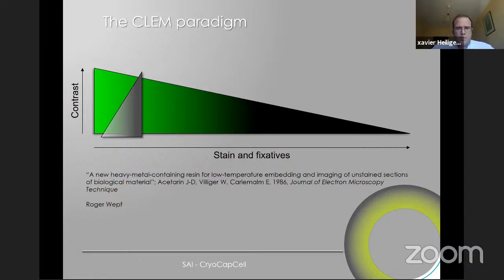There were these papers back in 1986 that presented a new resin that would be interesting for doing this kind of very low contrast adding, because the resin was already containing some heavy metal. So he asked me whether I could develop or reproduce this resin.